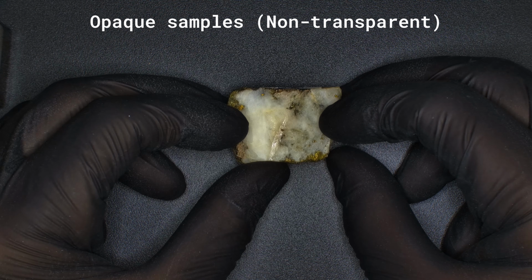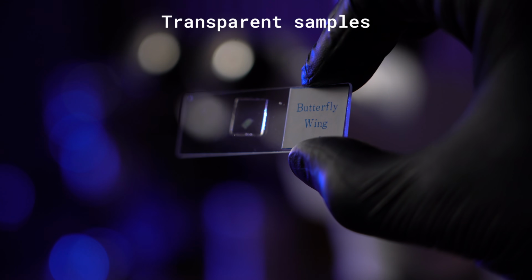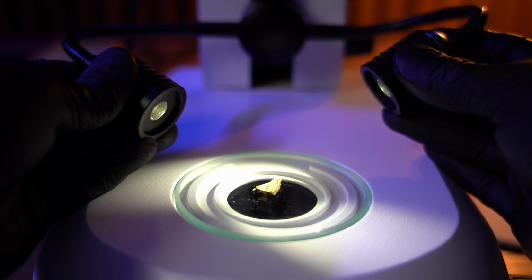Let's start by dividing samples into two basic types: opaque samples and transparent or semi-transparent samples that let light pass through. This directly affects the type of illumination you'll need. Some microscopes have both transmitted and reflected light, but that usually increases the price. Let's look at examples.